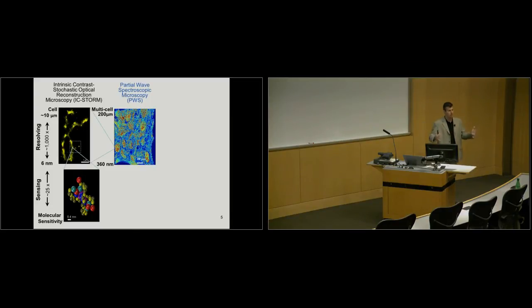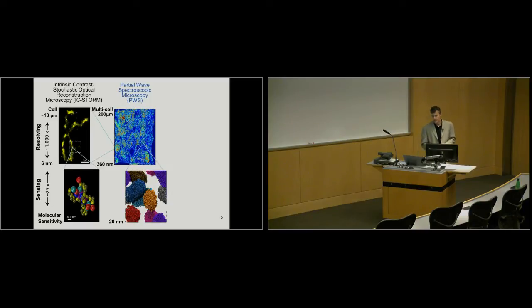We're talking about a much larger, hundreds of microns field of view, with the resolution going down to a few hundred nanometers. It's also a very powerful technique to image cell dynamics, essentially intracellular dynamics, with the rate measured in milliseconds. And the sensitivity of this technique is down to 20 nanometers, and in addition to that, it's a very powerful tool to image even very subtle dynamics at the nanoscale.